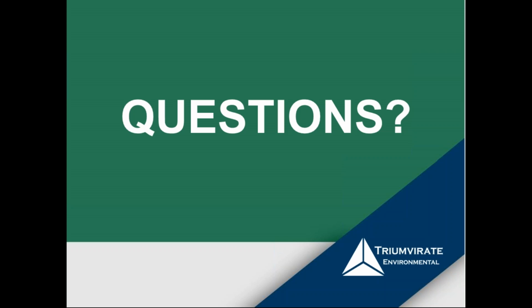Question from Carol. Should institutions conduct any survey, especially in clinical spaces, for this issue? Absolutely. I would highly recommend that. And keep in mind that plumbing systems are only visible in the lab to a certain extent. Once something hits a wall, something could completely change. We've done these assessments for people just to see their clinical areas, to see if there's any associated hazard. An inspection is definitely recommended, and it's something we can help you with.